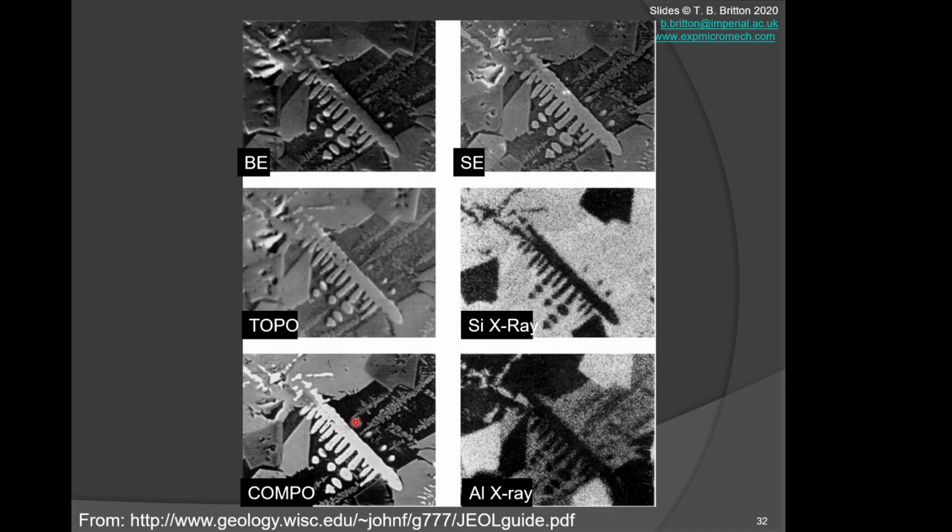And if we look at aluminium versus silicon, and I have to peek at my periodic table for this, they are very close to each other, but broadly, silicon is heavier than aluminium. So hopefully, if I've got this vaguely right, we can see that regions that are silicon rich compared to aluminium rich will look slightly brighter, i.e. this region, than the aluminium-rich regions. And this is a precipitate with slightly different chemical composition.